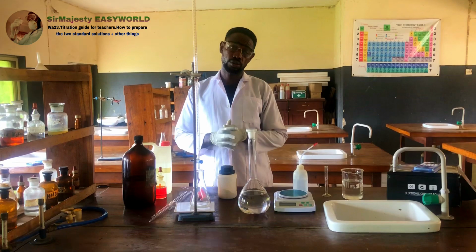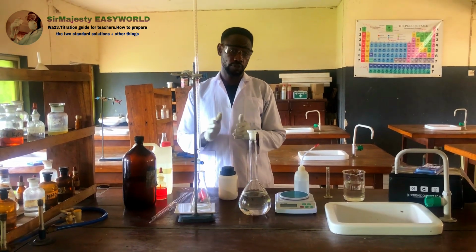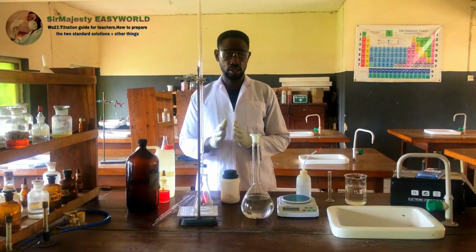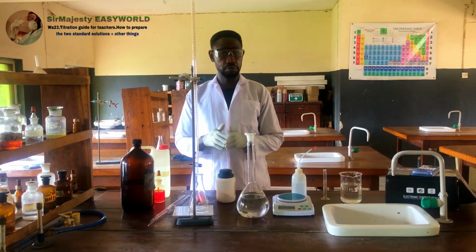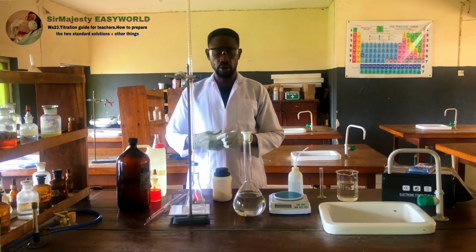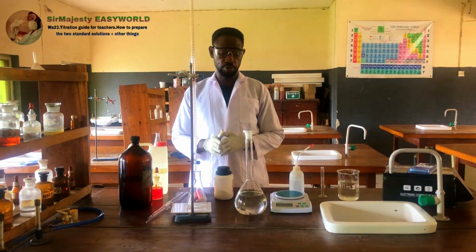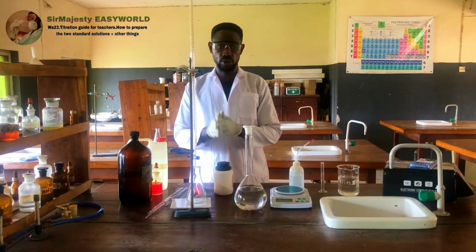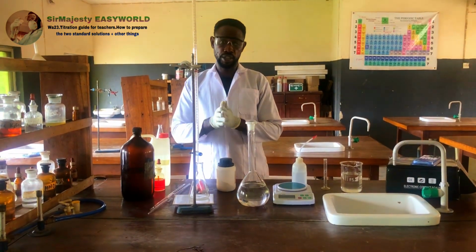Prepare the standard solutions in the titration between sodium carbonate decahydrate and hydrochloric acid. The challenges that follow this titration, the likely questions, their answers, and probably the correct endpoint. First of all, you might be finding the endpoint challenging, maybe because you did not get the right product or you did not prepare the standard solutions very well. If you listen to me very well, you will know the best thing to do.